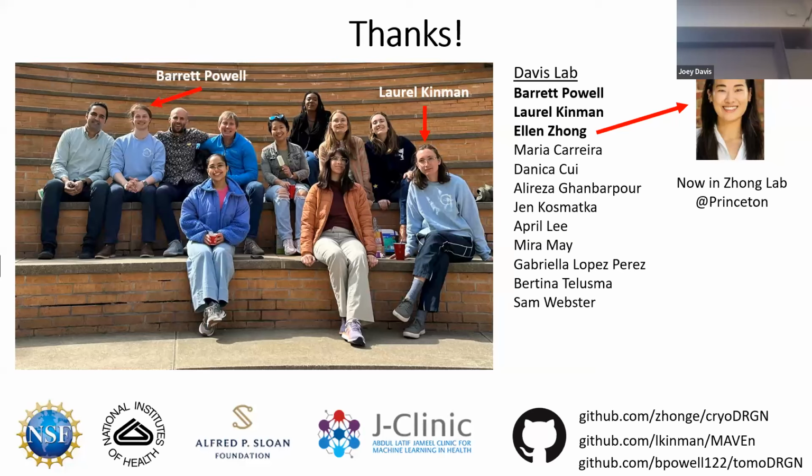Yeah, I think it's the key question. I still see structural biology as a hypothesis generating tool. Solving structures allows you to generate hypotheses about specific contacts, for example, function. And I think that the onus is on the experimenter to then use other tools, for that interaction for example, using those hypotheses, doing those experiments, seeing what the new function is, and seeing what the changed structures are. That's really required.